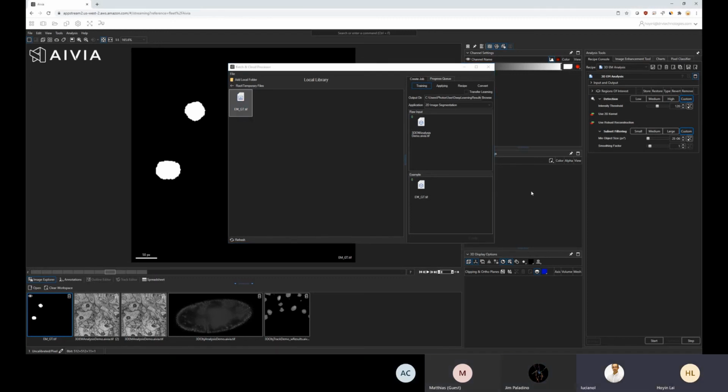Okay, so continuing on. When you're doing the training, especially when you have a large number of 2D slices or 3D data sets, you want to make sure that the raw input and the example match. So let's say I have 200 slices of the image and 200 slices of ground truth, I want to make sure that the input slice matches the ground truth slice based on the number in the upper left corner. If they're mismatched, it will just generate really garbage results.